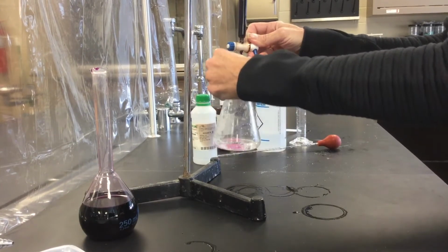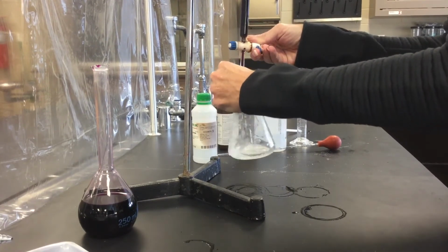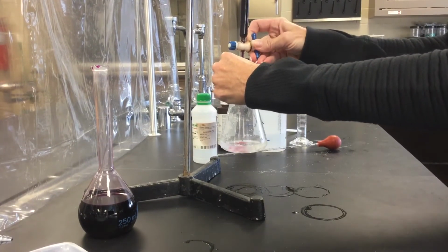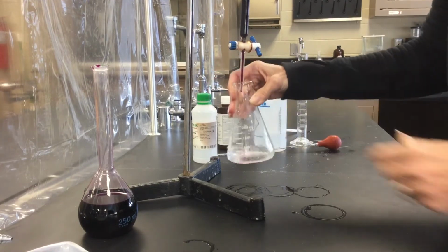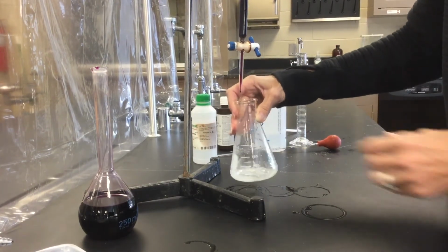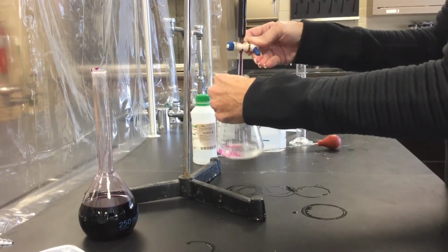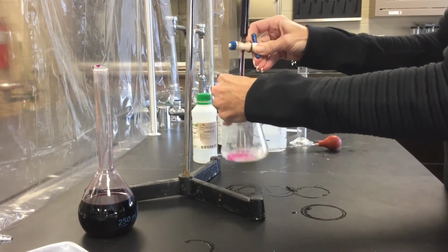Again, you can see the bubbles forming as the hydrogen peroxide reacts. Okay, so I'm coming up on 30 milliliters, which would be about 14. So I'm going to start slowing down.